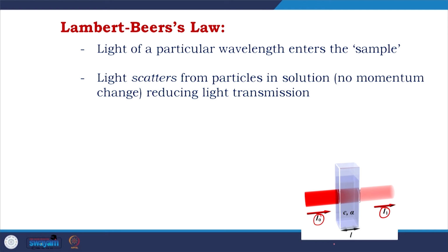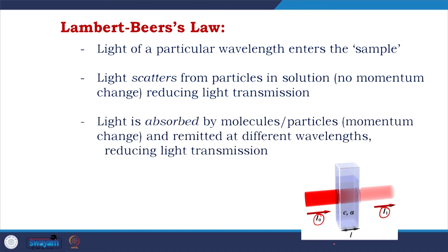Light scatters from particles in solution, with no momentum change, reducing light transmission. Light is absorbed by molecules and particles, with momentum change, and re-emitted at different wavelengths, reducing light transmission.